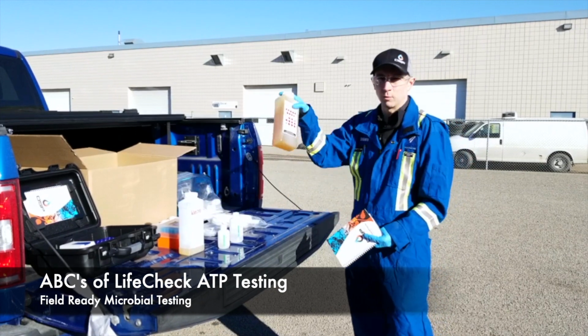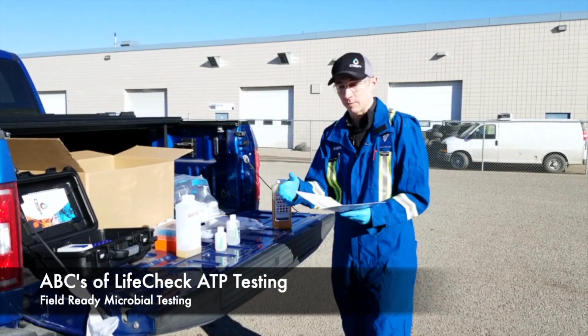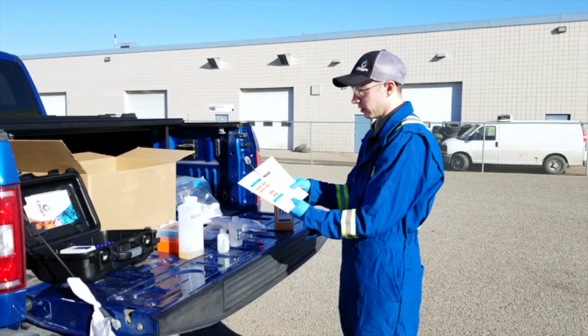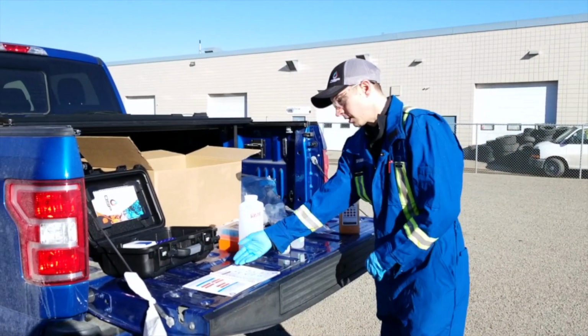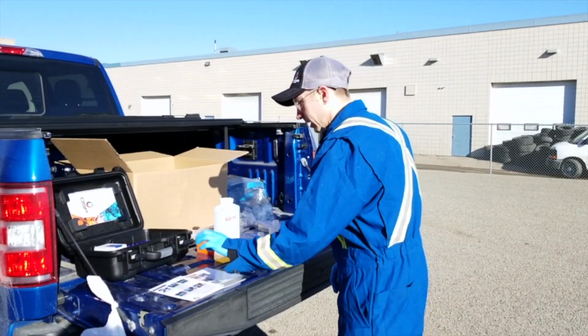Alright, so we've got our wellhead sample that we are now going to be testing for ATP to get the active microbial count. So using our LifeCheck ATP Test Kit handbook that comes in all of our kits, we're looking at part A1, which is on page 9. This is for liquid samples. Everything that we're going to be using is out here, and we're going to get right into it.